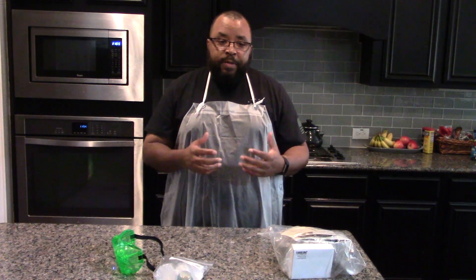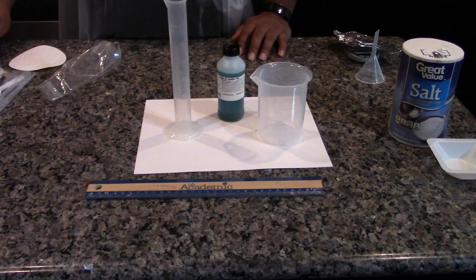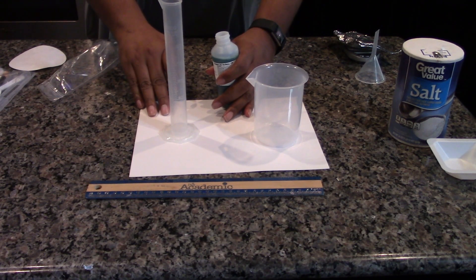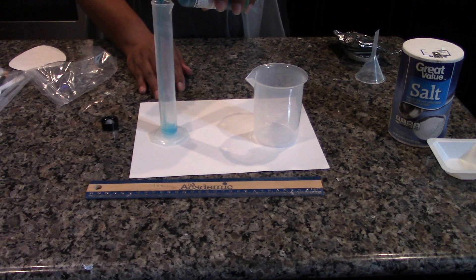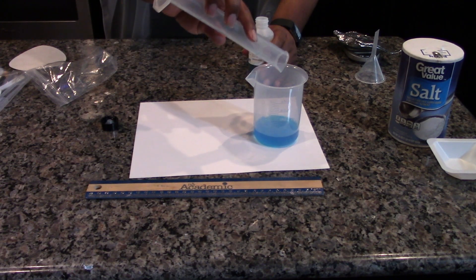So let's look at the materials that we need for this experiment. Here is a list of the materials needed for today's investigation. Use the 50 ml graduated cylinder, measure all of the one molar copper sulfate that's in the bottom, and place it in the 250 ml beaker. Record the total volume in the data table.